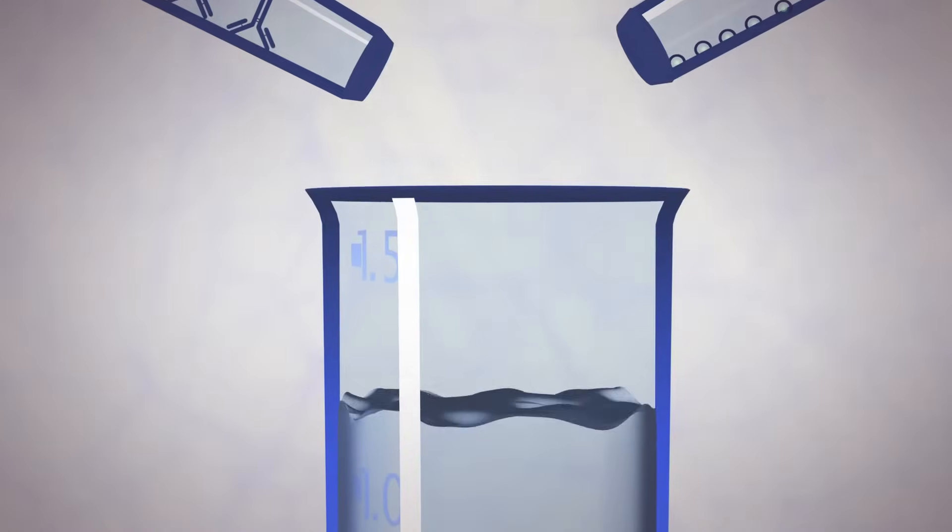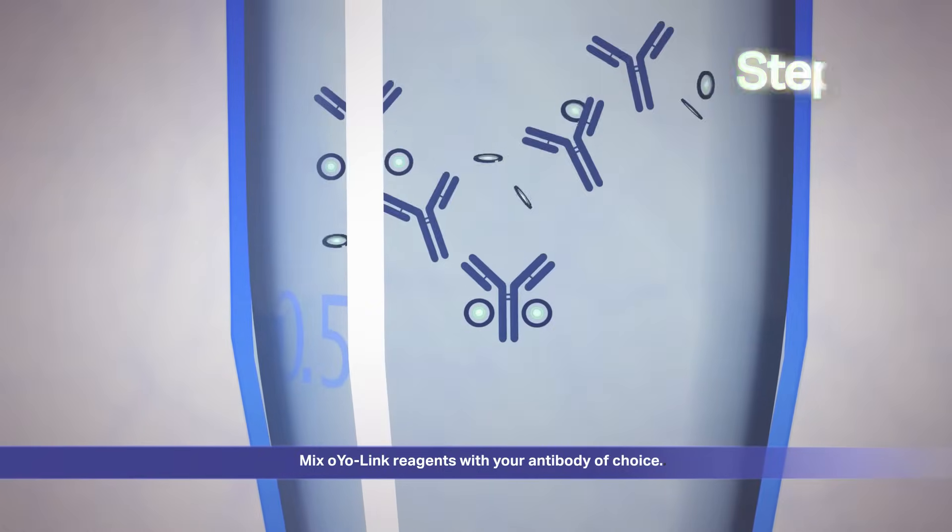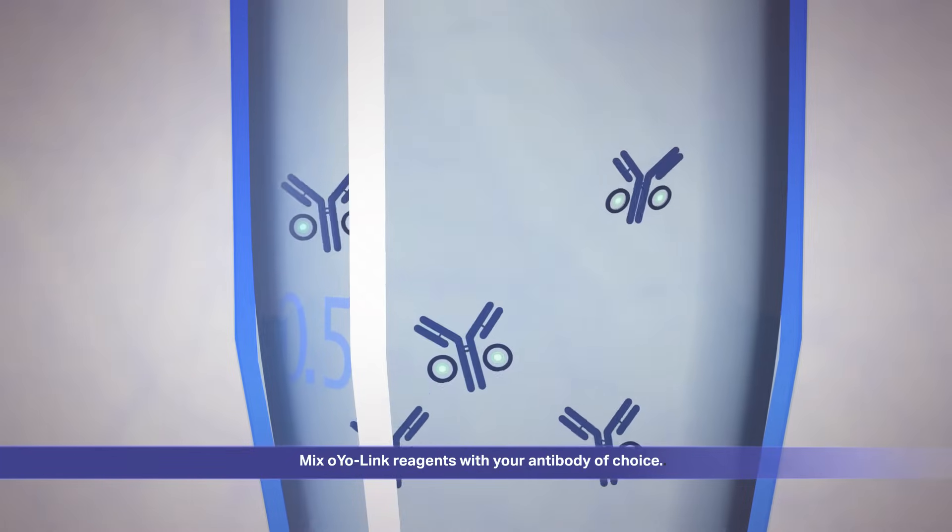Antibody labeling with OyoLink products requires just two steps. First, mix the OyoLink labeling reagent with your antibody of choice, and OyoLink will bind to the heavy chain with high affinity.